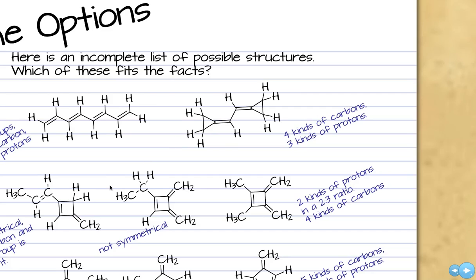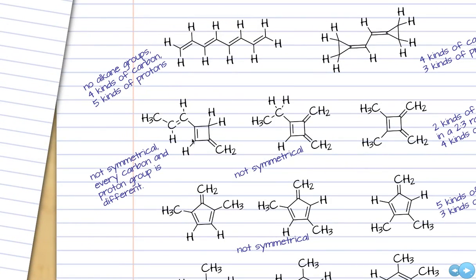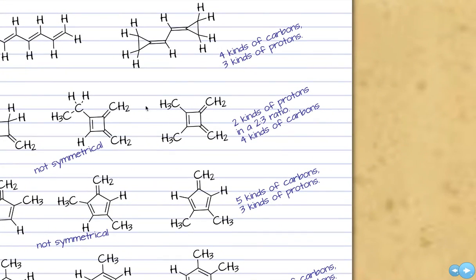So, that's not fitting. I tried 4-membered rings. And that leaves you with a lot of spare carbons, which you can decorate around. But what happens is, these first 2 proposed structures with asymmetrical substitution, then all the carbons are different. 8 different carbons, that doesn't fit our model. But here's something. Ooh, that looks good.